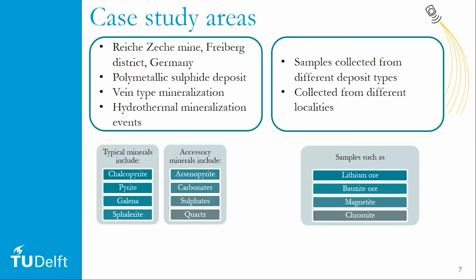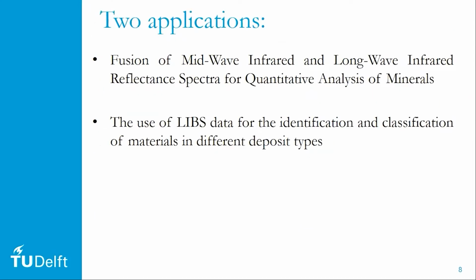For example, we have lithium ore samples, bauxite ore samples, and different other samples from different deposit types. This gives the opportunity to investigate the usability of technologies in different material mixtures. So different methodological approaches were developed to extract information from different sensors. Individual sensor technologies were assessed, and data fusion was implemented at different levels to see the performance of the individual techniques with the fused data blocks.